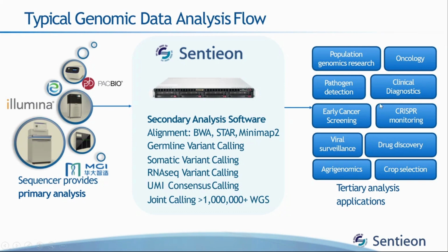So in order to reach this tertiary analysis, we have to use bioinformatics tools or software that are capable of understanding this sequencing data and annotating them with our research objective. To perform this secondary analysis, we do have open source tools, and one of them is GATK, the standardized pipeline for variant calling in somatic and germline datasets. So think of Sentieon as a similarly built pipeline for variant calling that builds upon the algorithms that are used for GATK with certain added features.